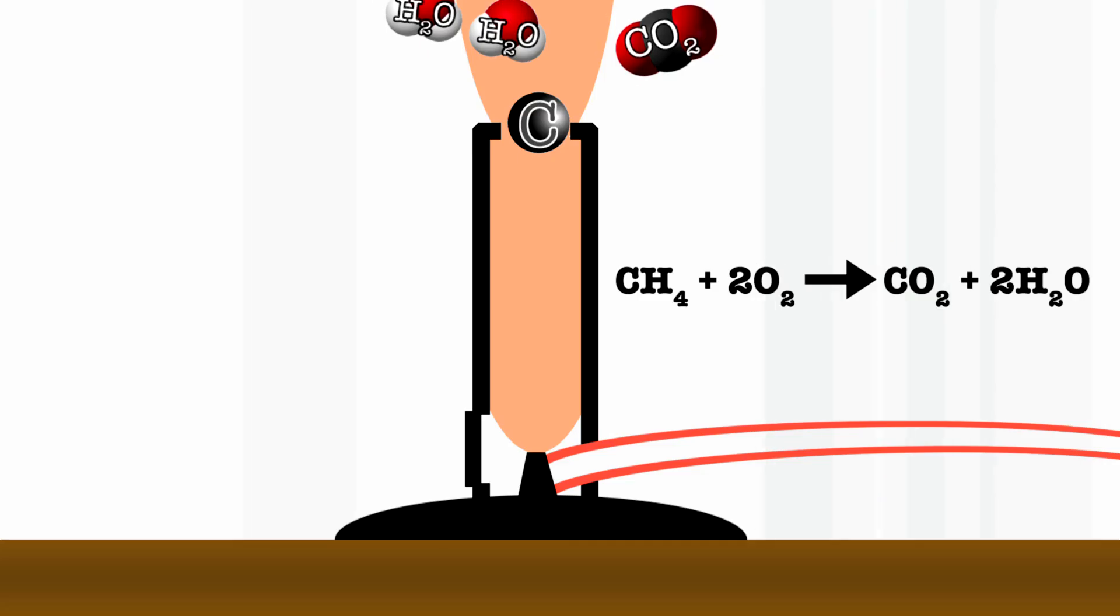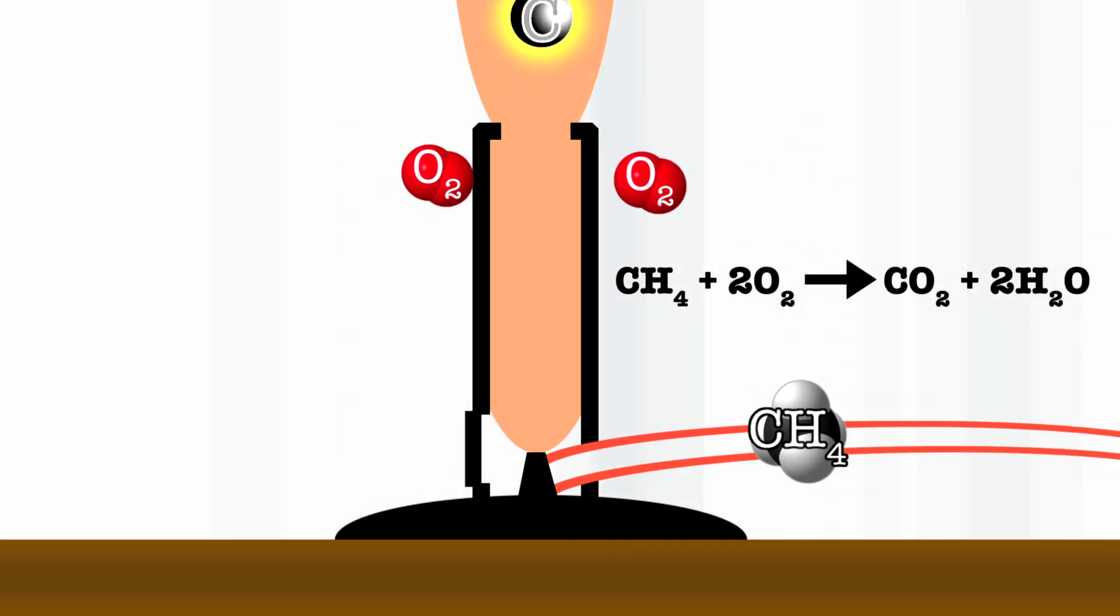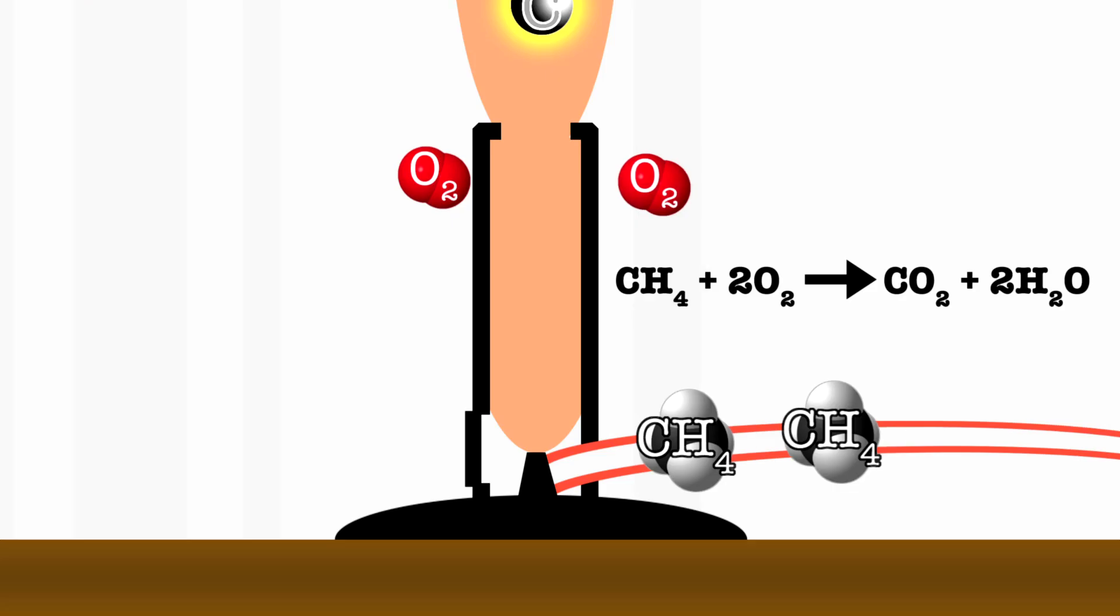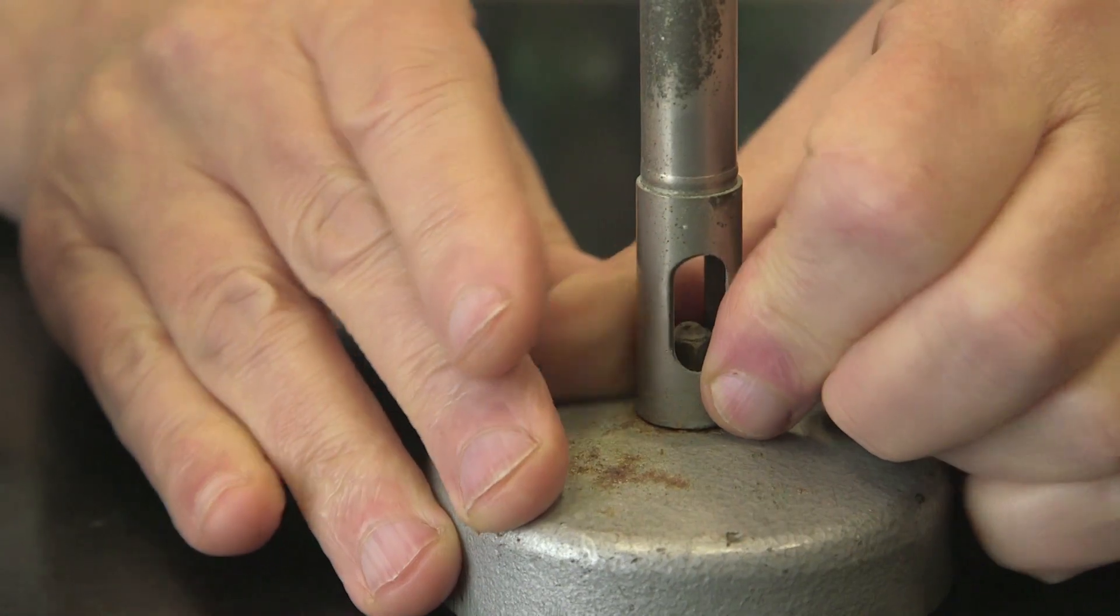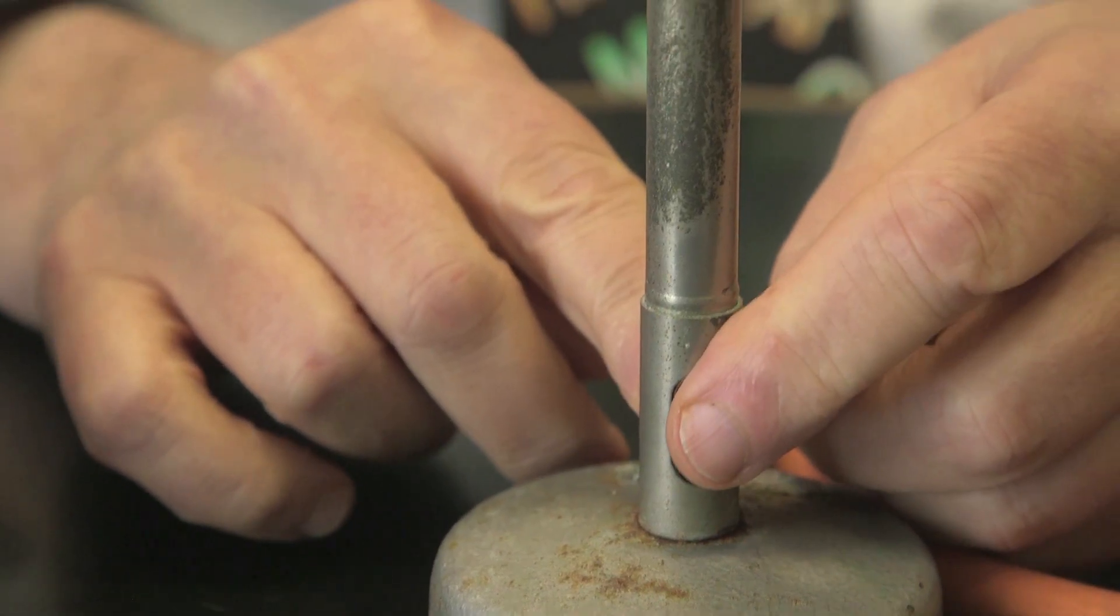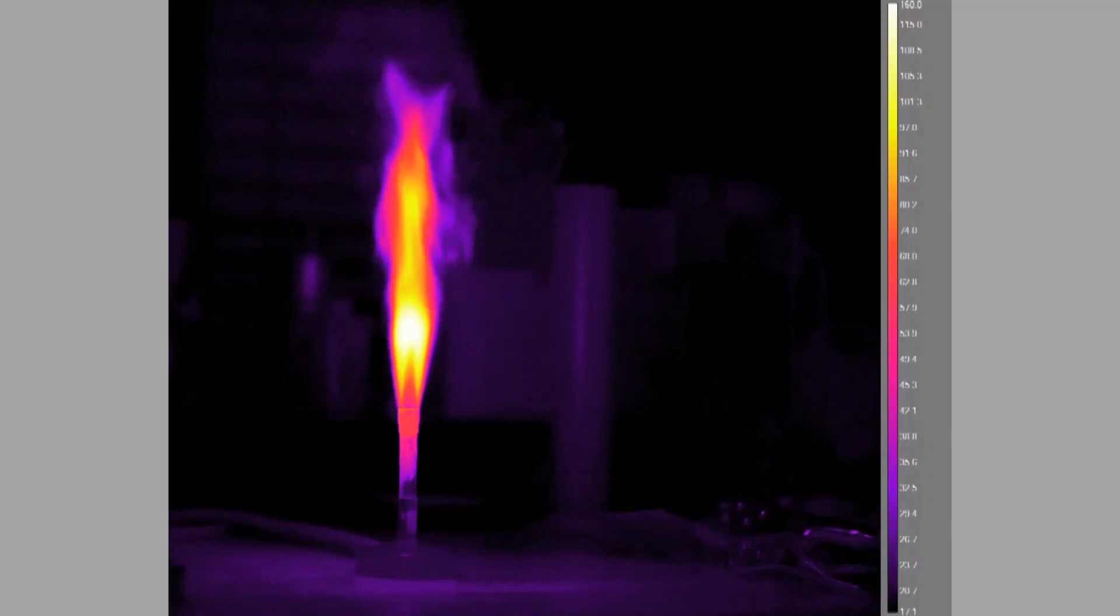But the yellow color of the flame comes from those carbon particles. When the holes are closed, the gas doesn't meet any air until it gets to the top. When we open the holes, we mix gas and air down here and then they burn right at the top. They burst into flames and the flame is much hotter because the reaction is much faster.